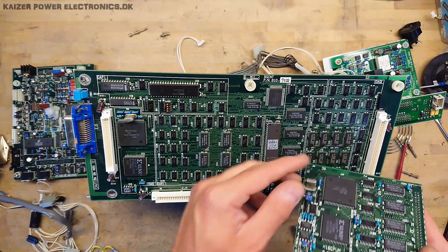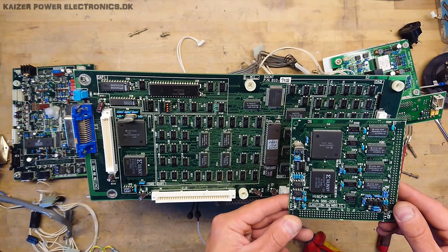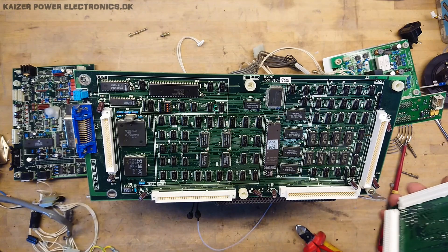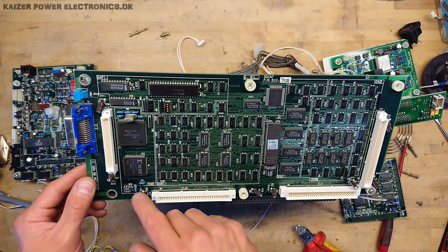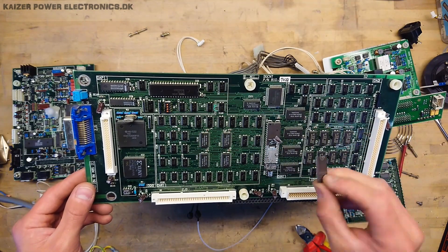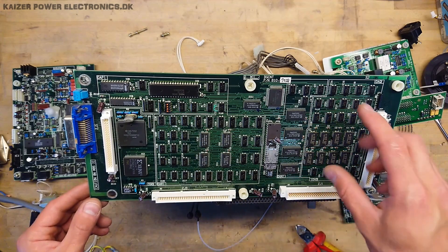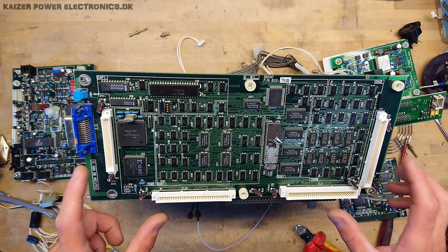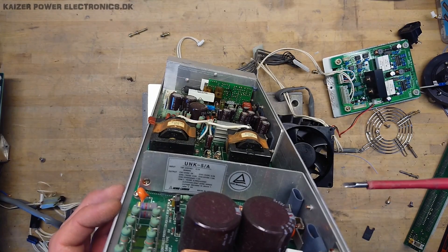It has a 16 MHz crystal, so at least one of the CPUs is running at 16 MHz. At the bottom we have a repeat of the same FPGAs and microcontrollers. It has a broken EEPROM, but other than that it's just signal conditioning and protection for the two plug-in boards.